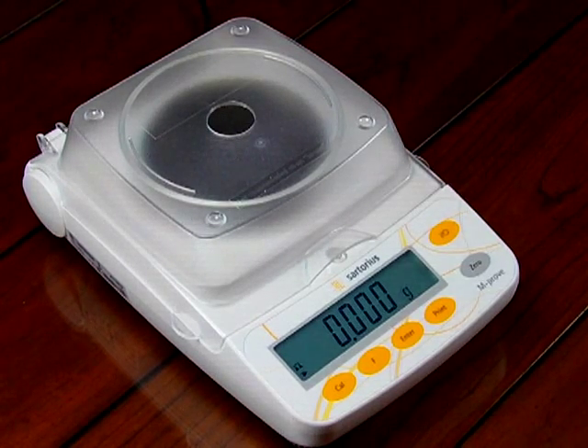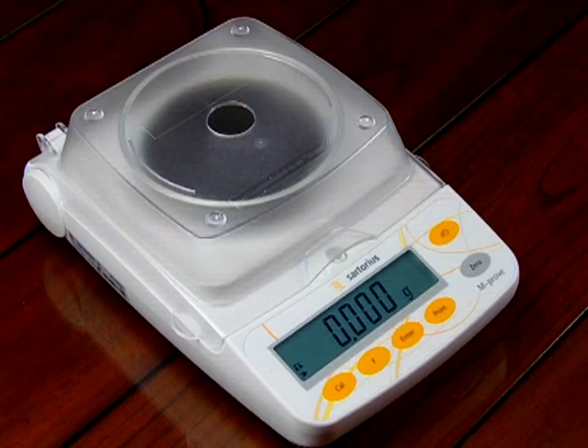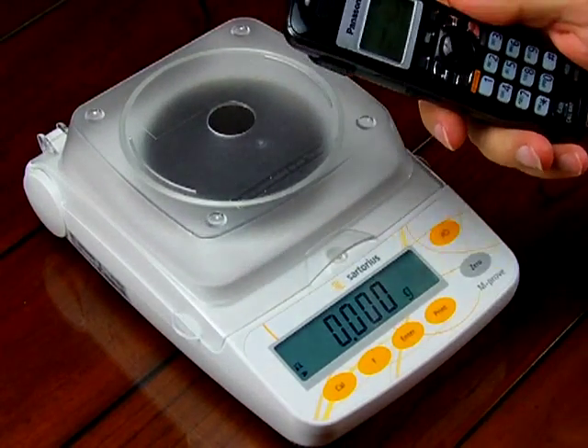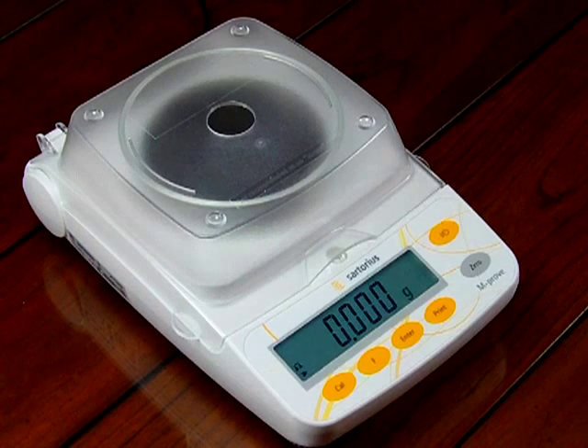In this video, we're going to give a demonstration of how electronic noise can affect a balance. The balance we'll be using is a Sartorius AY303. It's a strain gauge based scale. And we're going to show you how using a standard cordless telephone can really affect the readings of a balance — or how electronic noise can really have an effect on the balance.